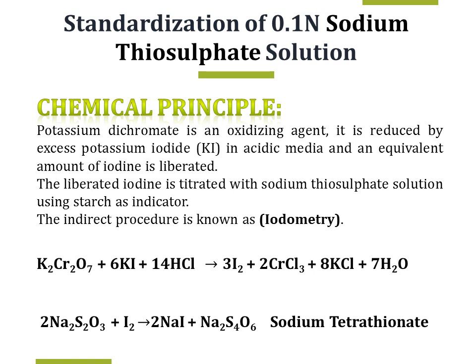In the standardization of sodium thiosulfate solution هنستخدم الايودومتريك titration اللي هو نوع من أنواع الريدوكس reaction. إذا لازم يكون عندي oxidizing agent, reducing agent و acidic media. Potassium dichromate is an oxidizing agent.